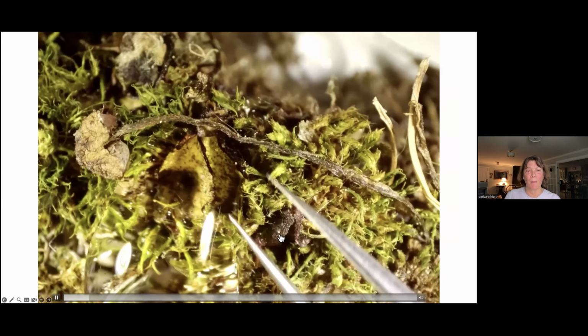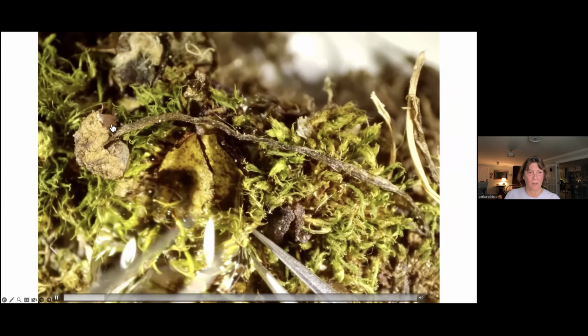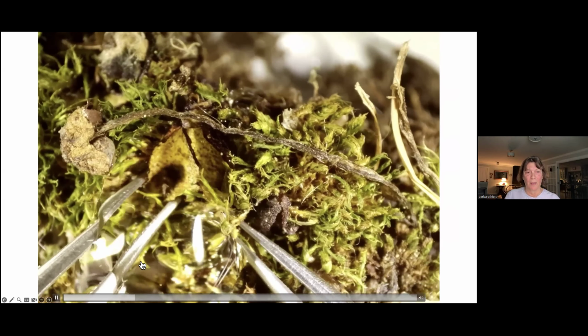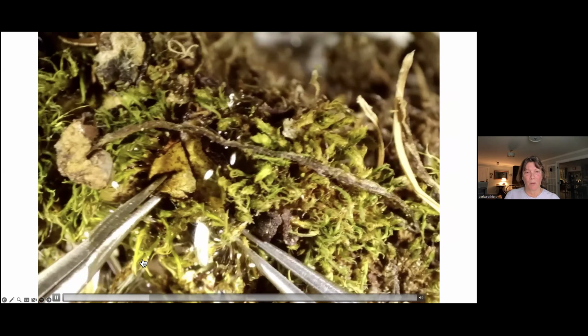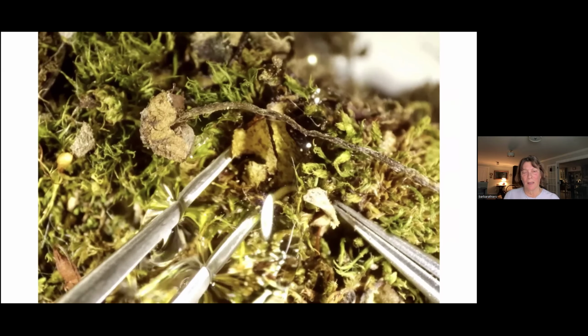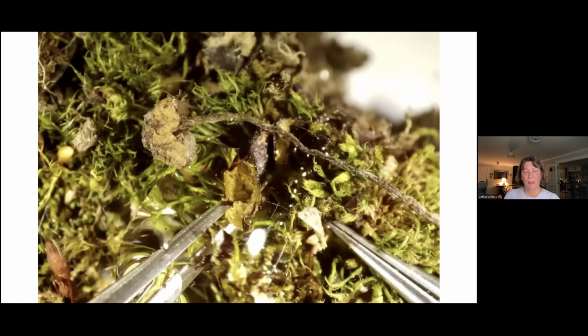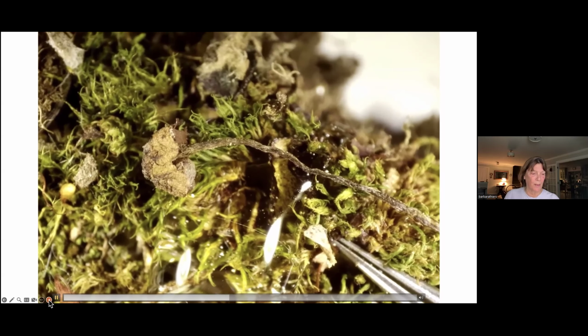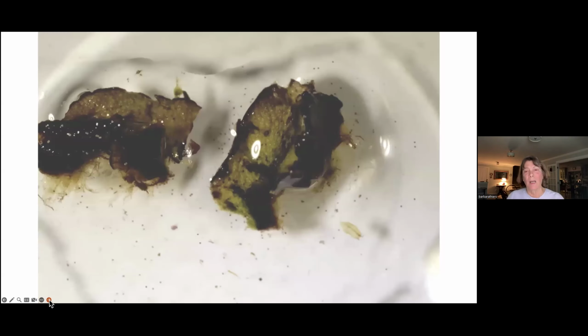But again, I've put a drop of water on, and you can see the sporophyte is laying across. Here's the thallus in this area. And I'm going to reach in and pull off some pieces. I kind of mangled that one, but I will eventually get it. Key being, I'm going to need to make sections of part of that thallus, but I don't need the whole thing intact for that. Here's a couple of pieces that I pulled off. You see you've got the upper surface here. It has purple scales on the underside. I'll say more about that in a minute, but that's what you're seeing there.